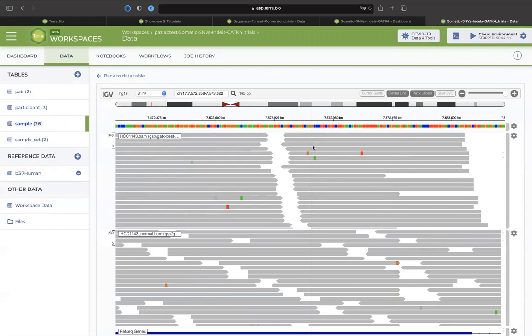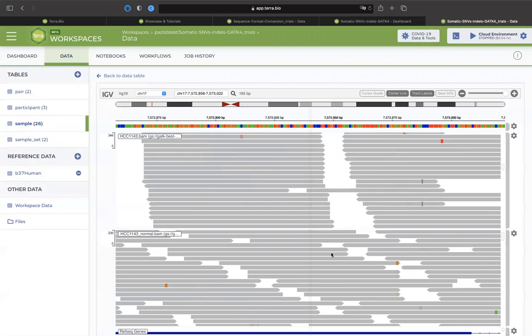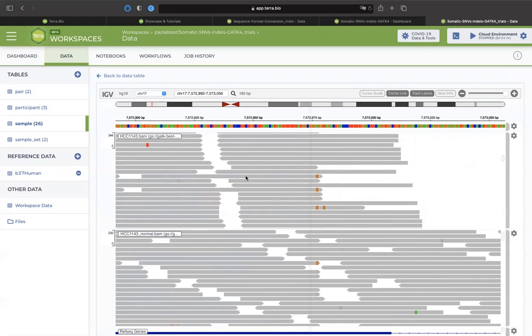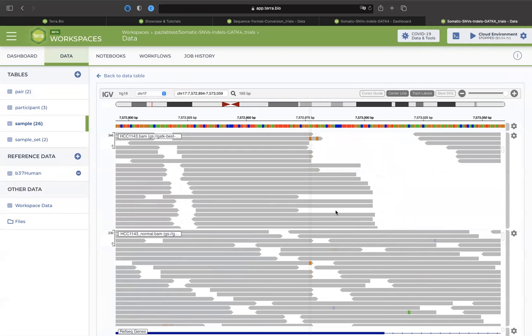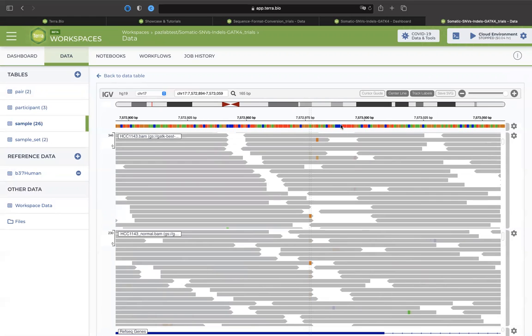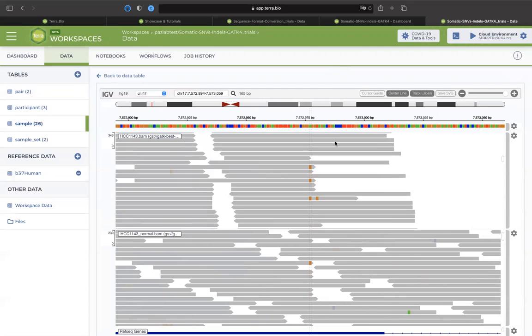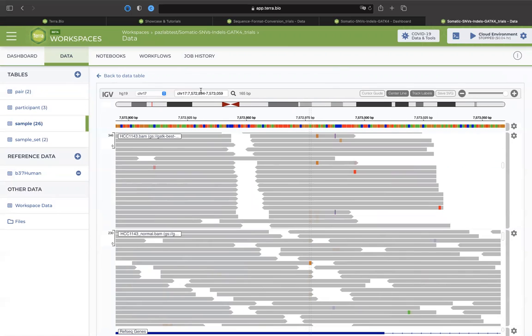So we are basically evaluating the reads to see whether the variants are represented in more reads. See this? See? I mean, though it's also at the edge of some of the reads, you could see it's represented in a lot of the reads. So that's what you could use the center line for. You could search chromosomes, you could search genes, and that's it.